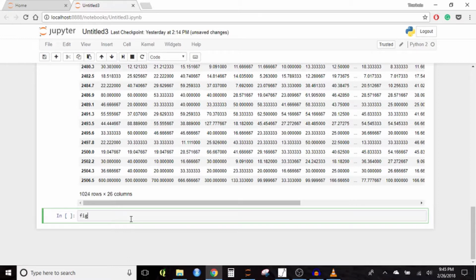So to do that, I'm going to start a figure instance. So fig23 is equal to plt.figure, and then we'll set the figure size here because it's going to have a lot of measurements in it. We're going to have a relatively large figure size, and that is going to be 14 by 7.